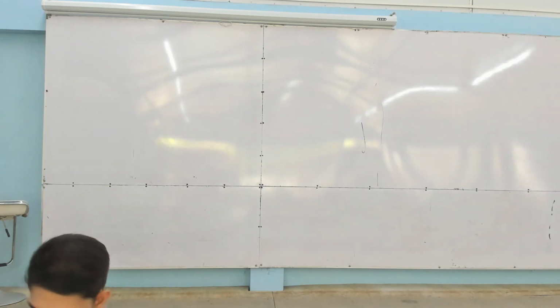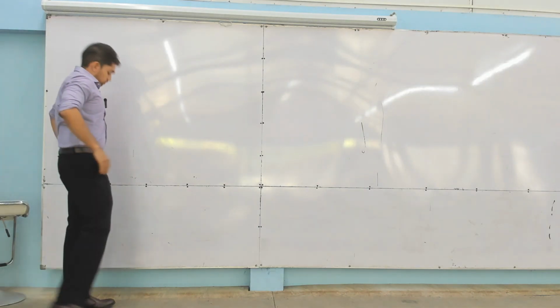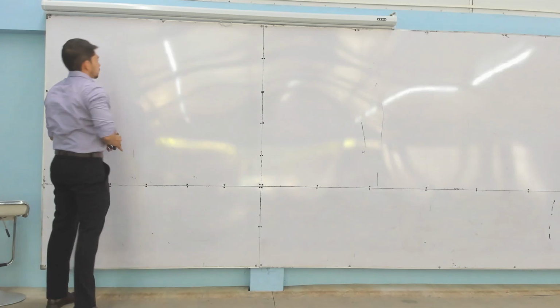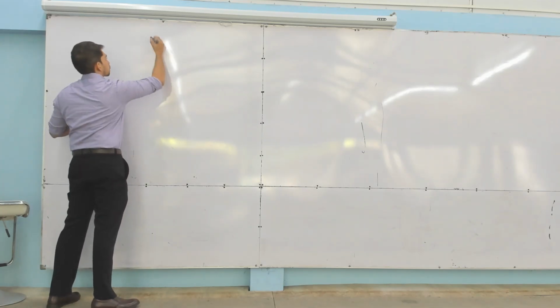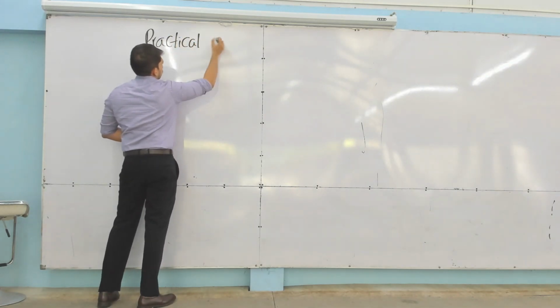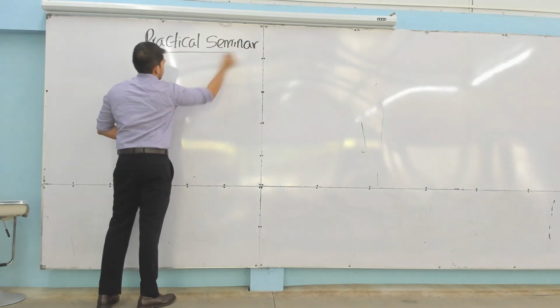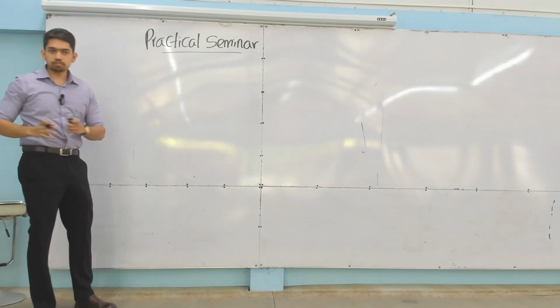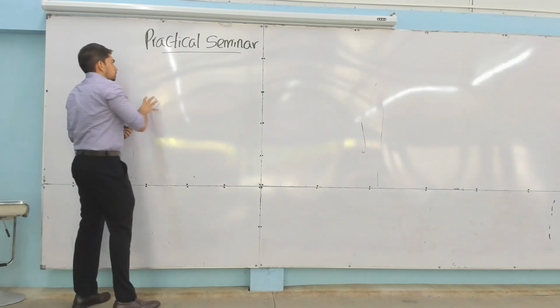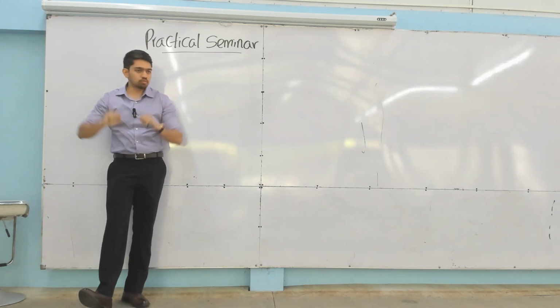Then the structure of today's seminar. So I planned it as a seminar. It's going to be structured like this. Let's see, with time, the maximum number of practicals we can complete. Here we have two main parts to this seminar.